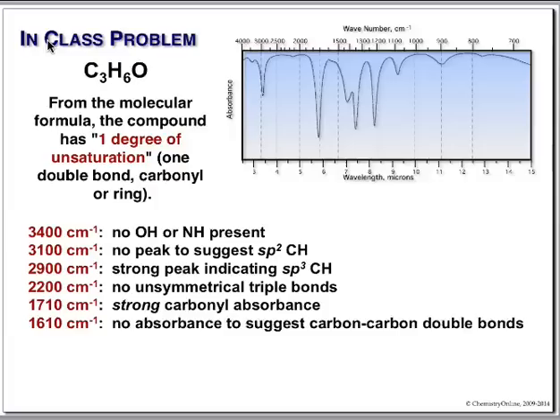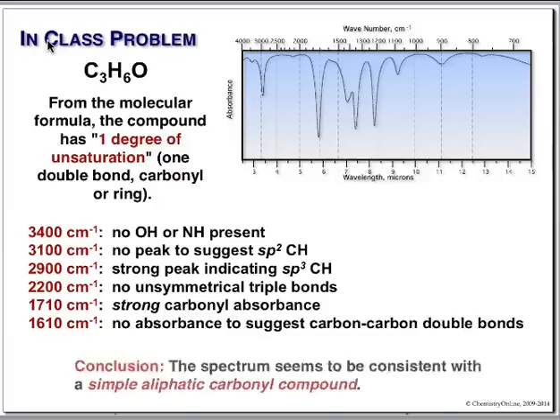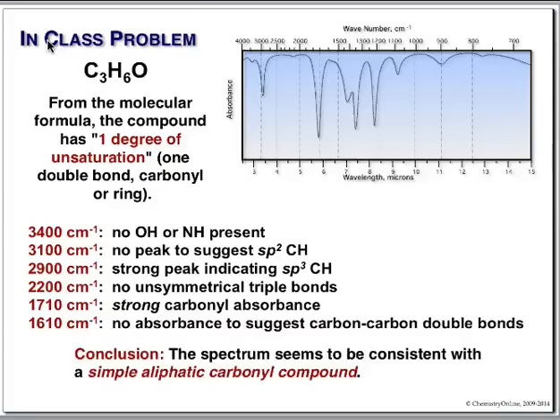All right, so we just read the spectrum. What we found out was, it looks like it's a simple aliphatic carbonyl. In fact, it's a ketone. Now is where you use a little bit of brain power, a little bit. You have three carbons. One of them is a carbonyl. It's a ketone. Only way you can put it together is to make acetone. Only way you can put it together. Any questions?